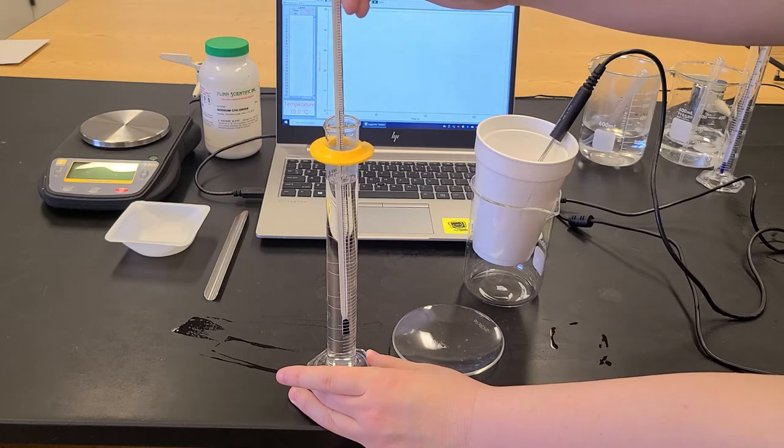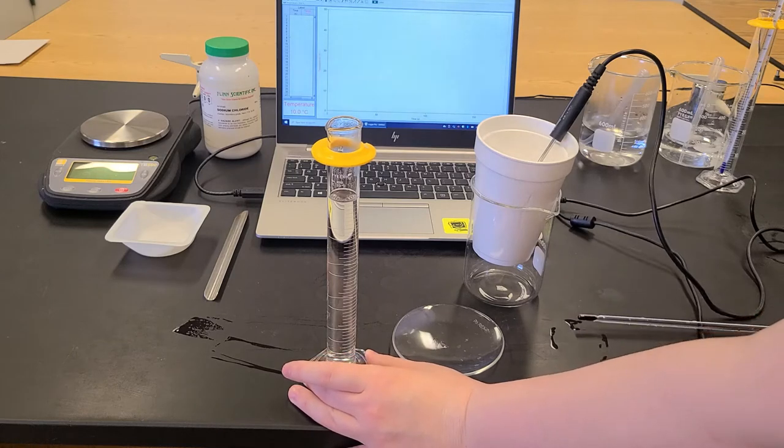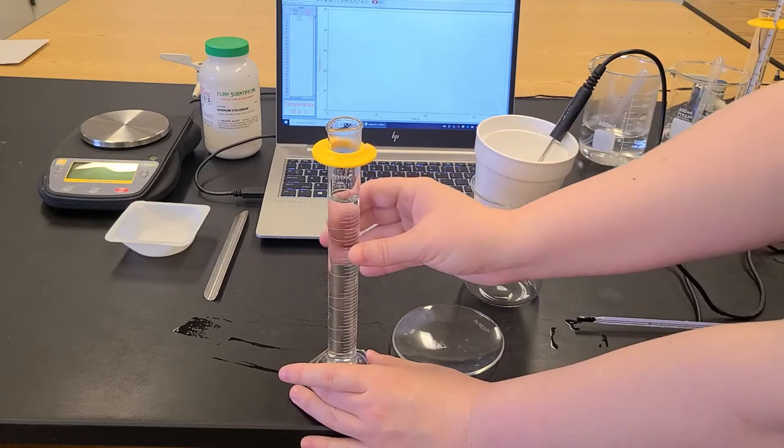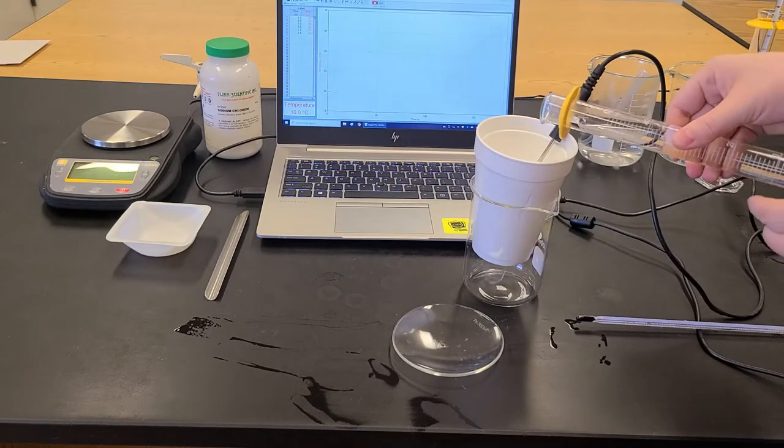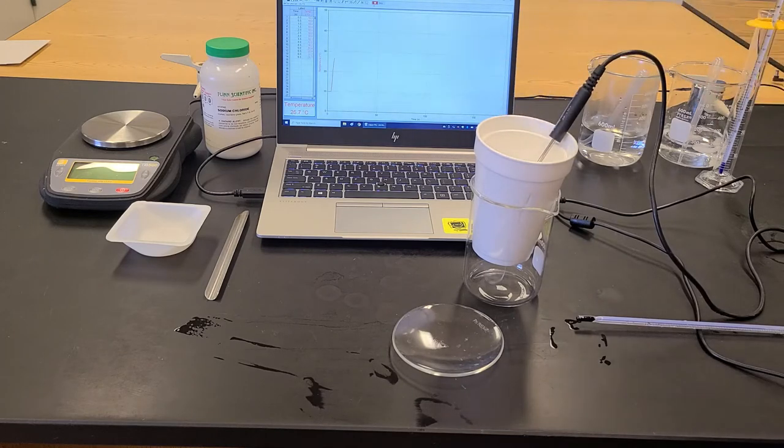So right now I'm recording the temperature of the cold water using my probe. And I'm going to press collect here so it will start collecting data. So I'm starting at my cold temperature and adding this hot water. And as I add the hot water you see that the temperature starts to climb really quickly.